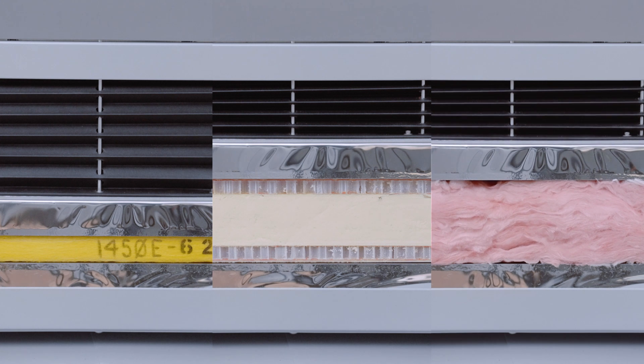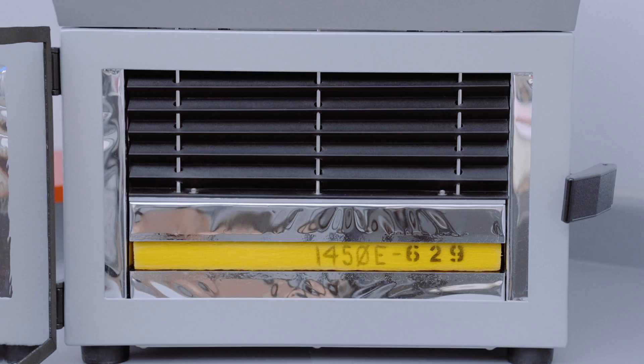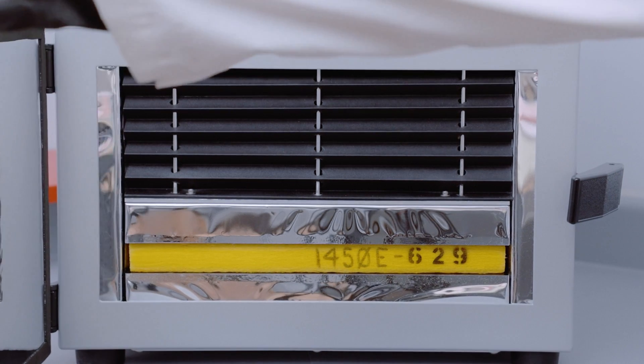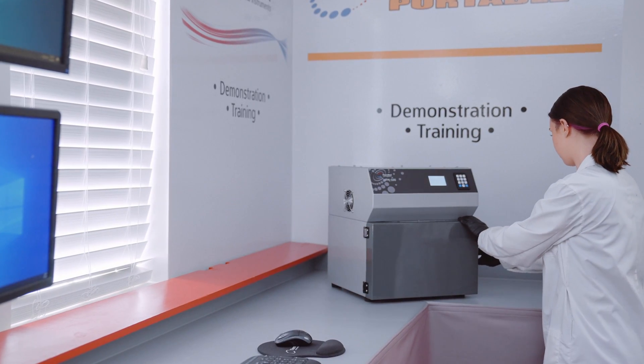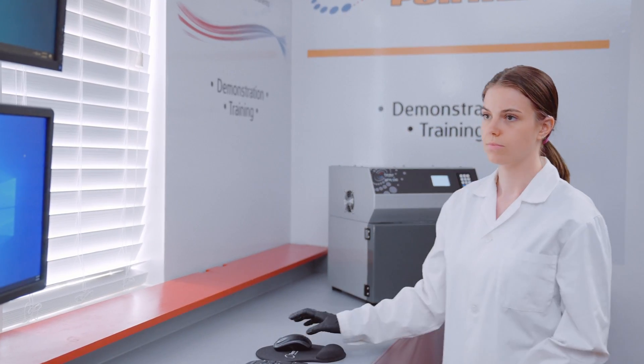In addition to front panel operation, the HFM 100 software gives the user unlimited steps of temperature automation while calibrating or testing.